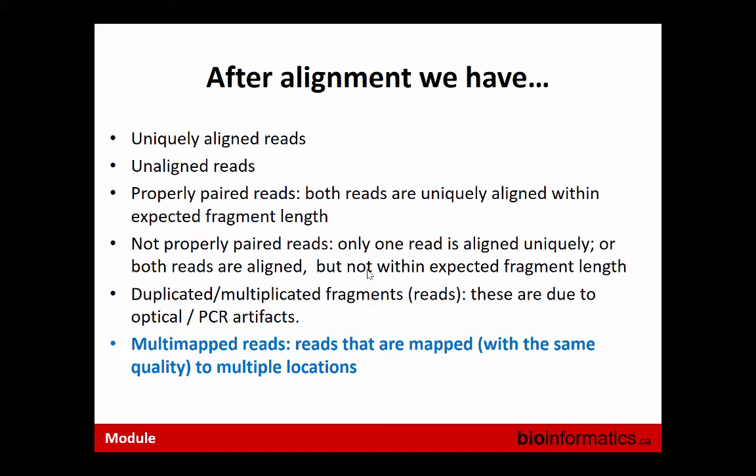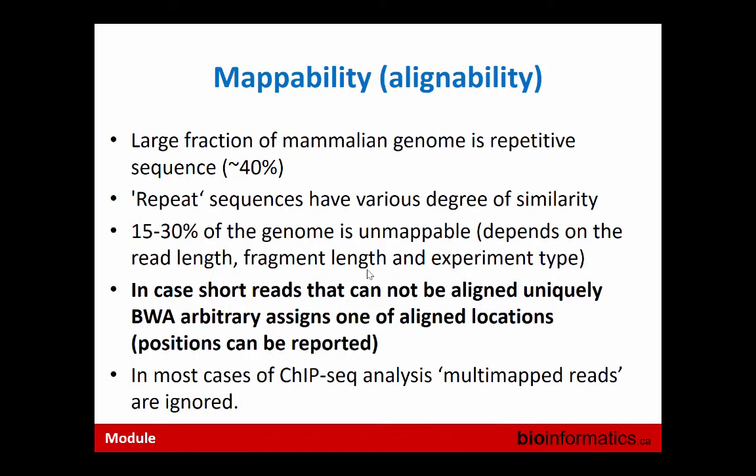However, not by default, we can ask BWA to report all locations where the read is aligned. So if somebody is interested, and if somebody studies repetitive elements, then that's a possibility. Now, this whole story about aligning in multiple locations is a bit of a headache in the analysis of all next generation sequencing experiments.